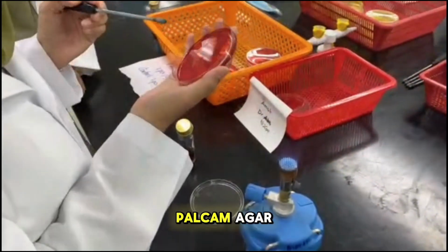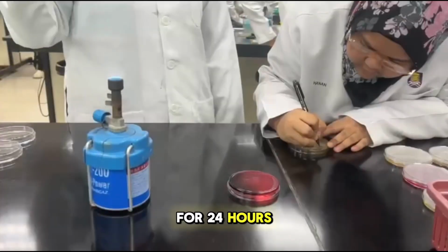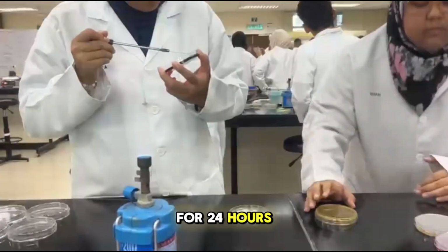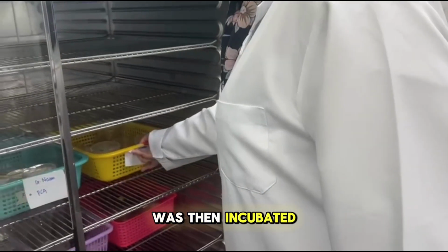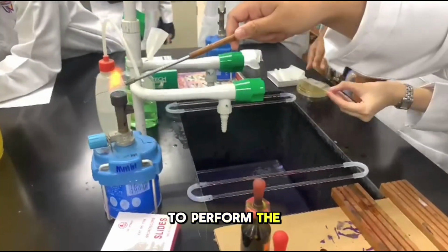The inoculated Palcam agar plate was then incubated at 37 degrees Celsius for 24 hours. On day 4, colonies suspected to be Listeria were selected from the Palcam agar plate and streaked onto TSA agar to obtain pure culture. The TSA plate was then incubated again at 37 degrees Celsius. On the last day, biochemical tests were carried out to confirm the presence of Listeria.